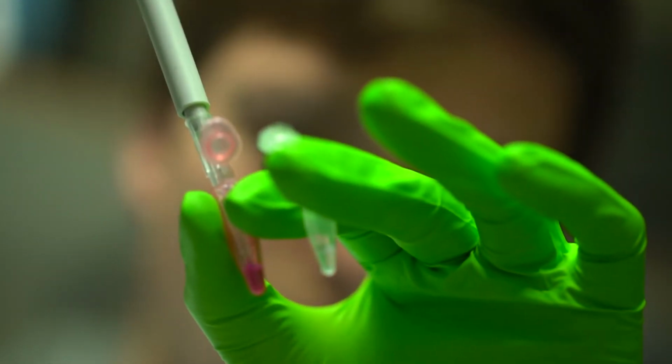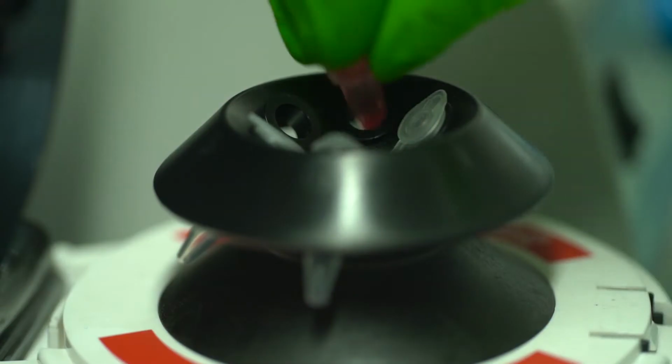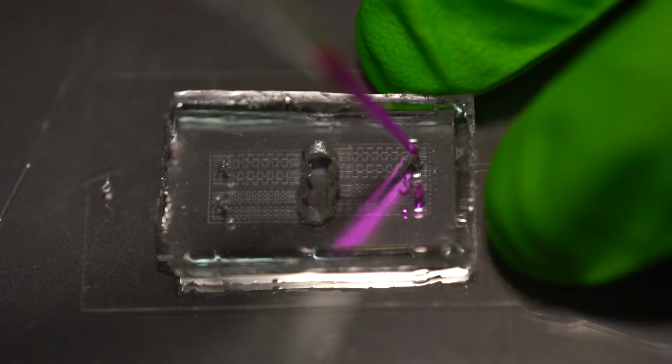For the other type of experiments, we made complex chemical mixtures based on numerous isolated cell components. The mix was then injected on the mini buildings to let the filaments grow from the facades.